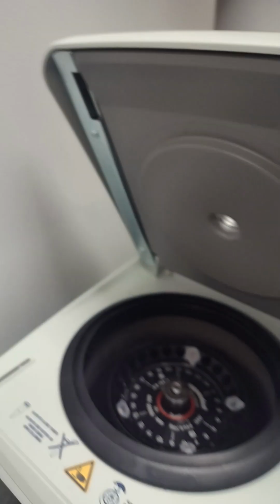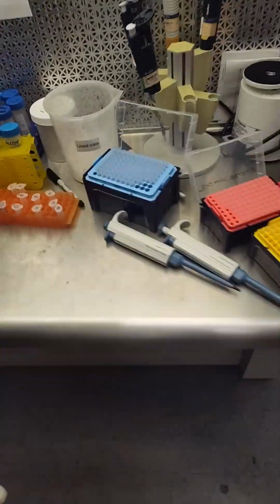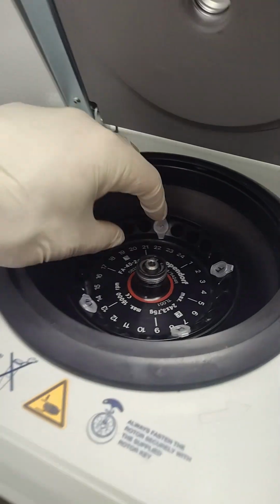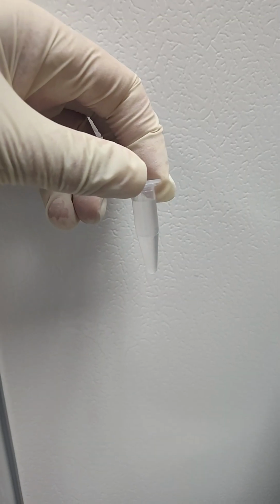I mean, the Viore is clear, so we don't know if the black color goes to the top or the bottom. Let's see, this is the Gildan. I think the color stays in the aqueous phase. So I don't know what we're going to find in the bottom layer, but we'll look at it on GC and let you know.